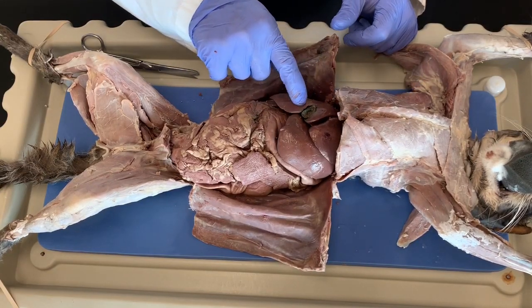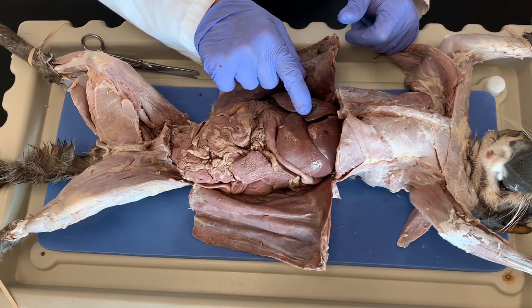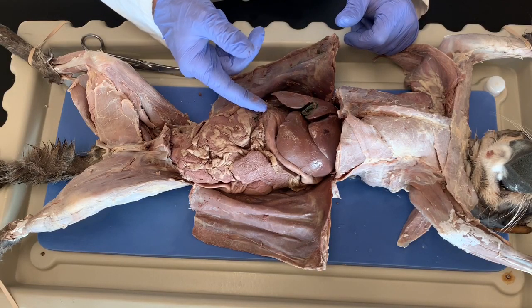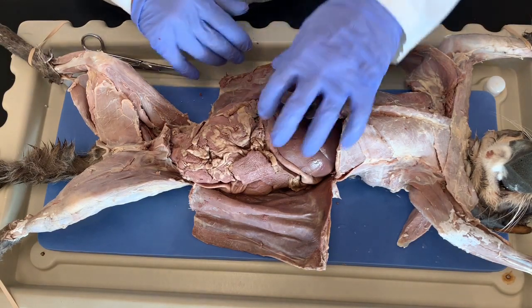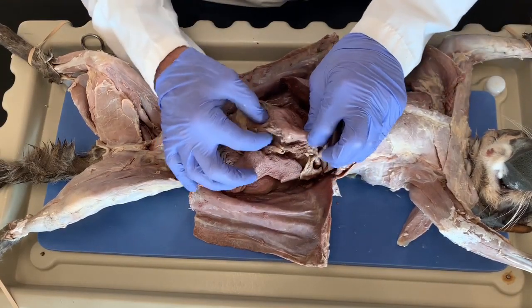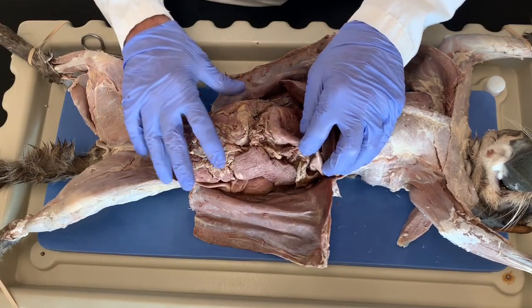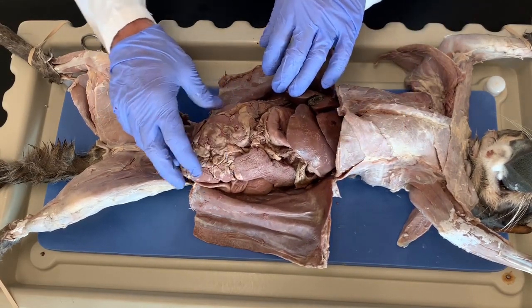The liver actually makes the bile, the gallbladder stores the bile, and then it goes from here in a passageway called the bile duct all the way to the intestines where it breaks up the fat. Okay, if I lift this up, you can see this is the stomach, okay? And attached to the stomach is the greater omentum. And the omentum is this packing peanuts for the abdominal cavity.